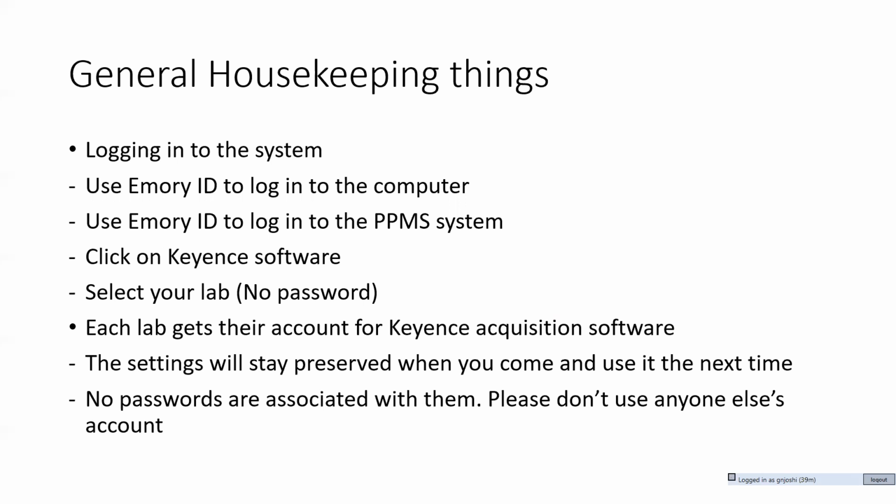The reason why I have created a lab is so that once you want to come back, the previous settings that you have used will be preserved, because people use the scope for different applications. I want to make sure that whenever you walk in, your settings are preserved. Don't use anybody else's account or even my account. Just stick to your lab account.